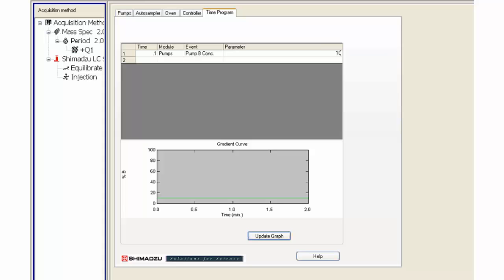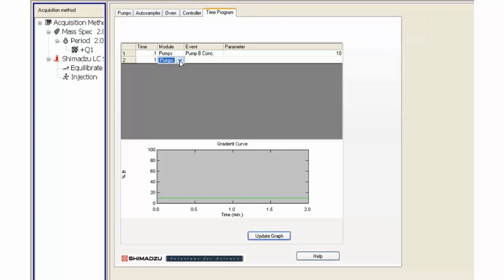Initial percent B must match the pumps tab information. Fill in when the gradient will reach its highest percent B concentration.